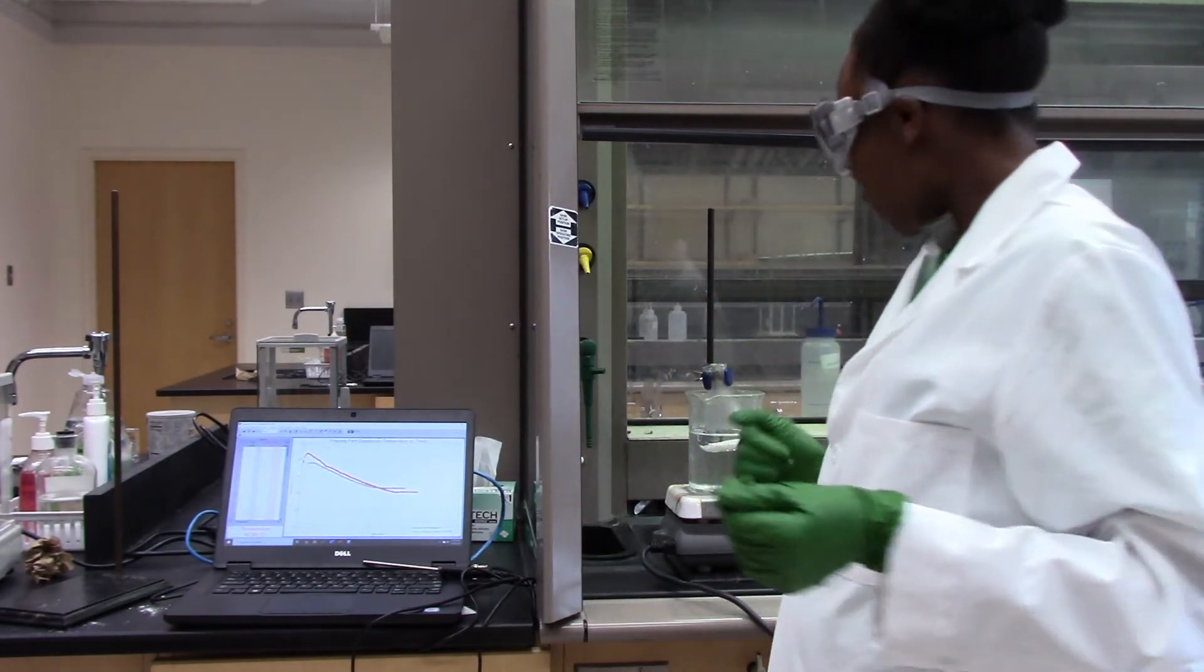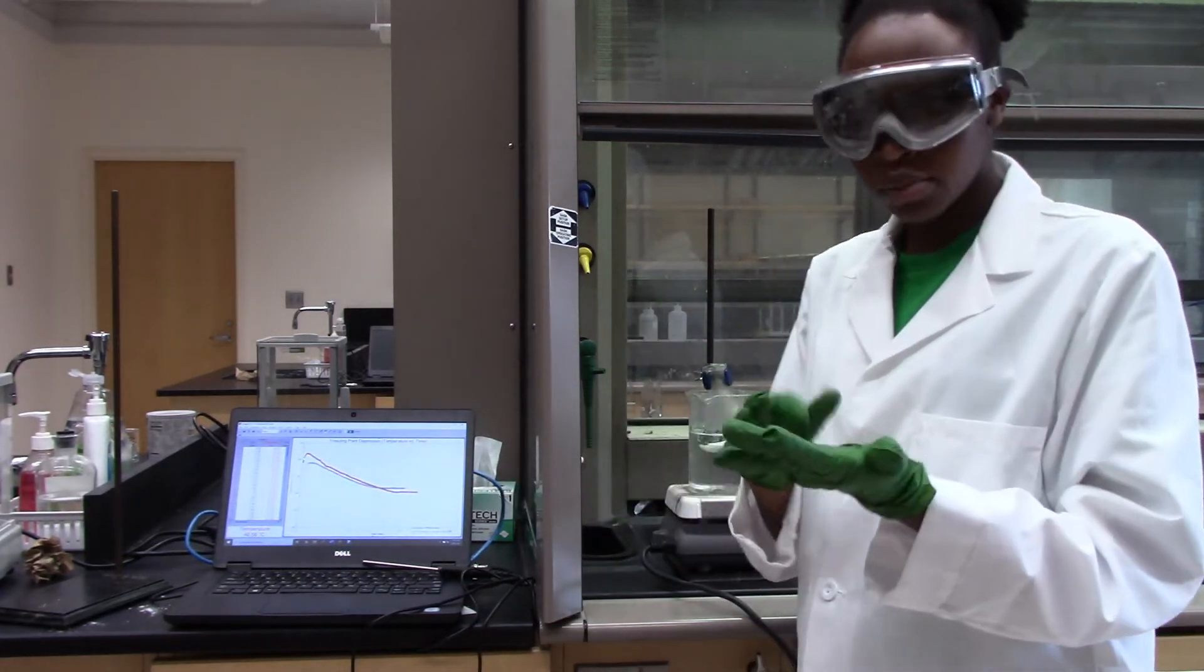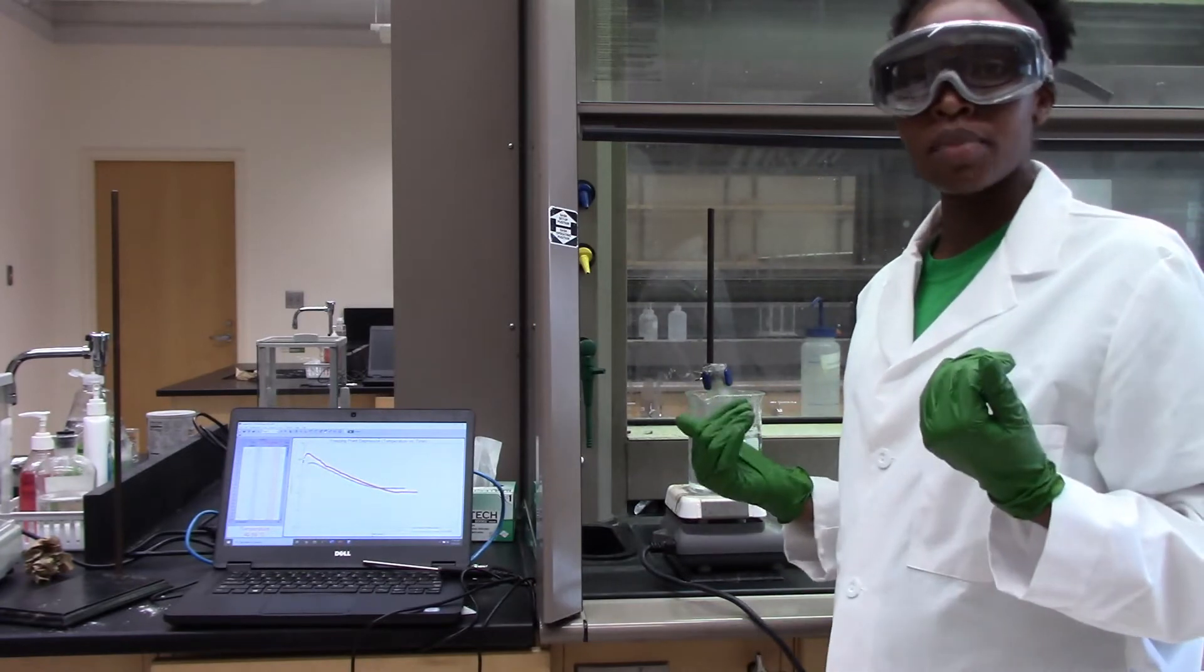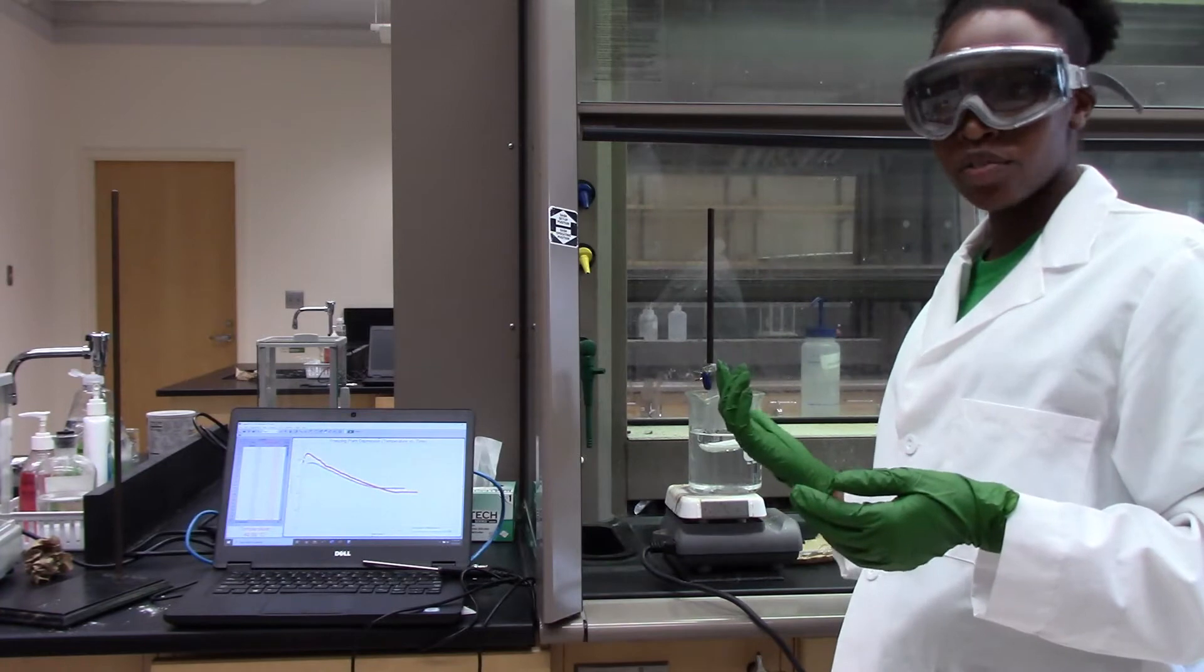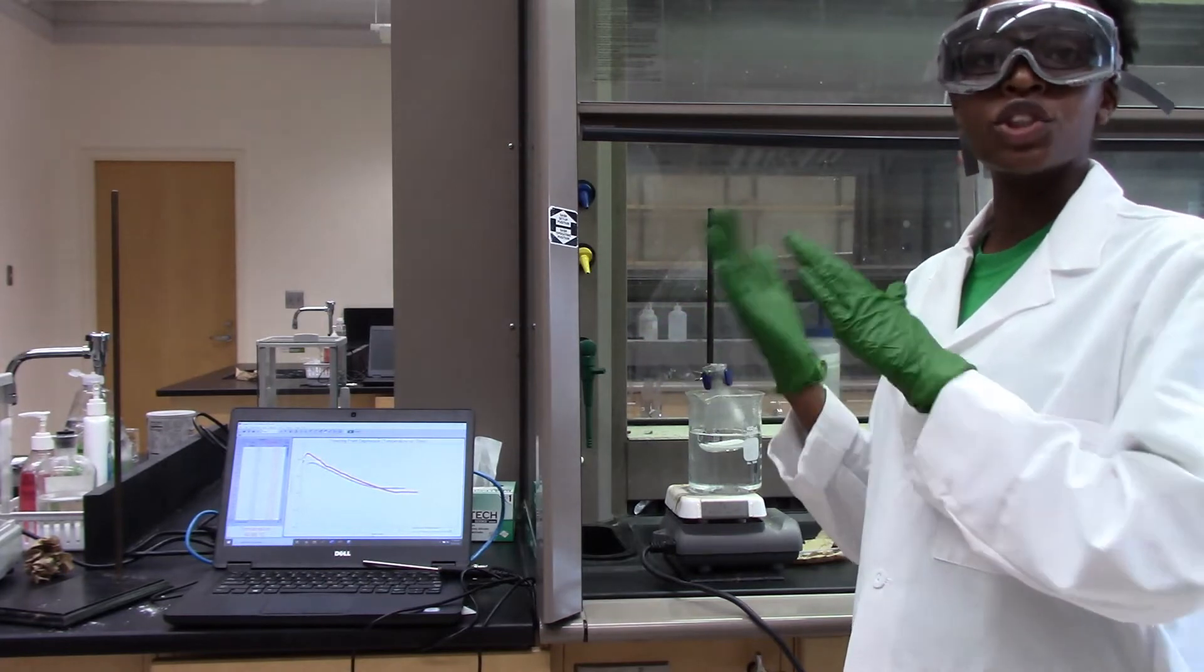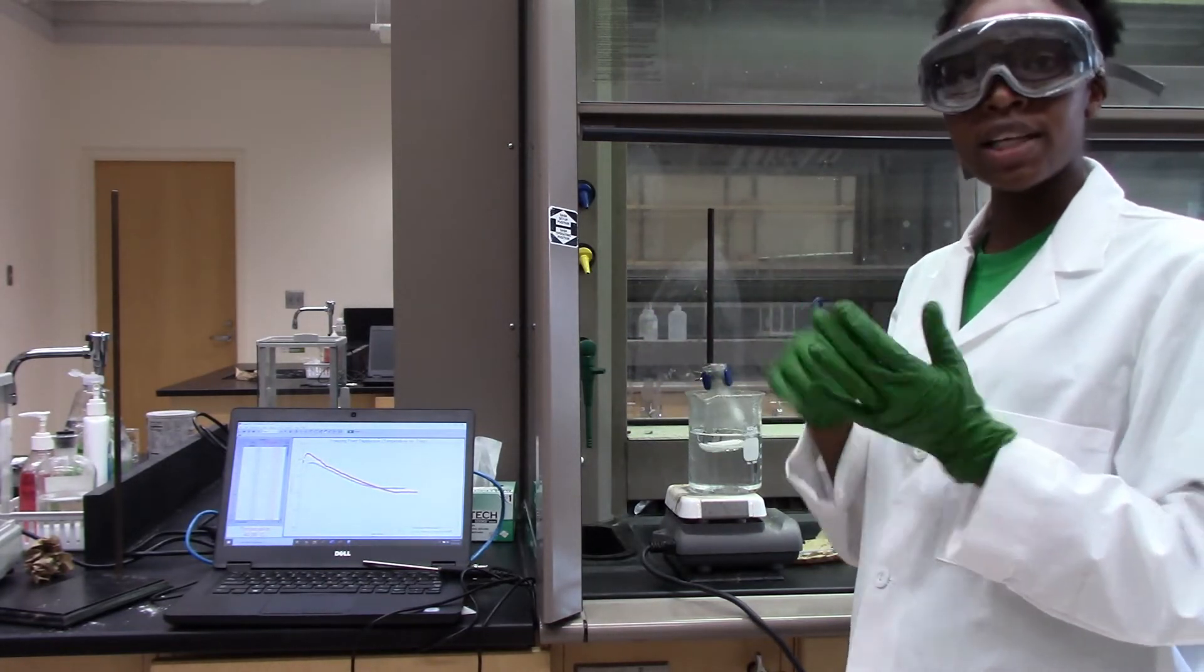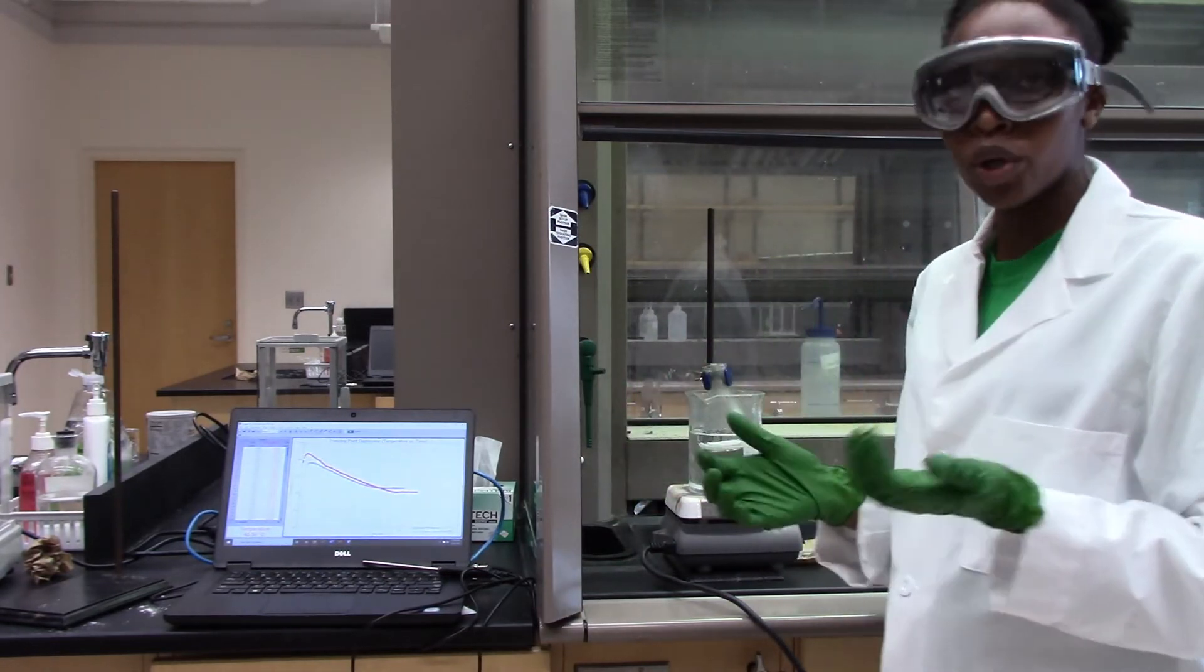So I'm going to heat this water above the melting point of lauric acid. I'll keep it about above 60 degrees Celsius. And once I have it in a liquid form, then the temperature that I will be taking is for it to change back to the solid from a liquid state. So when it does that at a constant temperature, that will be my freezing point for the pure lauric acid.